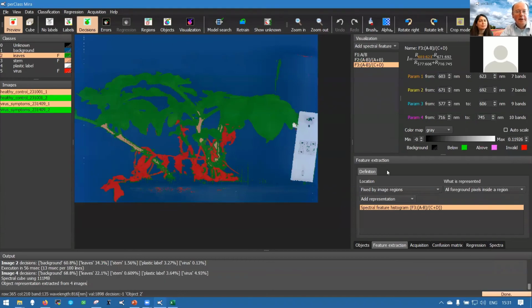So that's functionality that would be helpful if you are trying to find out differences between, let's say, stressed plants or other kind of issues. So you see that the definition of the spectral index, currently it's from a list of equations. So we are also interested in feedback, what kind of indices people use, and that clearly doesn't support everything, but it's quite a rich family already, and we are adding more functionality.